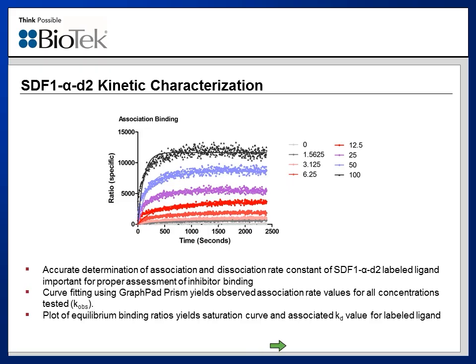The final residence time value takes into account the observed on and off rates of the unlabeled inhibitors, obviously, and is computed by the incorporation of the Motulsky and Mahan equation. The on and off rates of the labeled ligand are also necessary components of the equation.